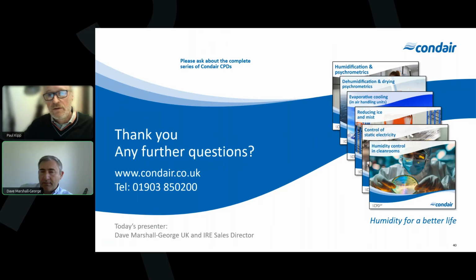Yeah, there is. Every sensor will have a tolerance, and that tolerance will change as well when we get to the extremities of that sensor's operating window. So we know a typical sensor will have a variance of plus or minus 1 to 2% RH or 1 degree C. And if we've got a variance in the humidifier tolerance, let's say a humidifier is capable of controlling to plus or minus 5% RH, then that plus or minus 5% could be in absolute terms plus or minus 7 to 8.